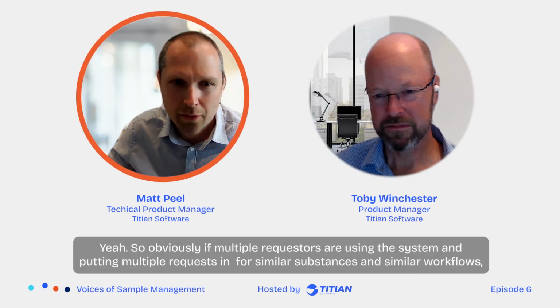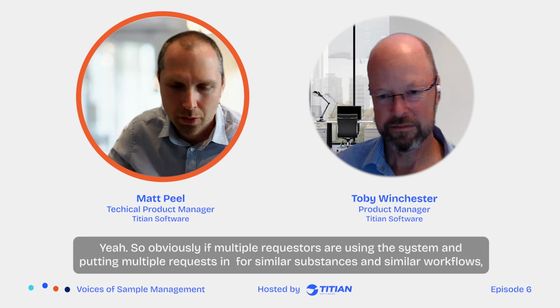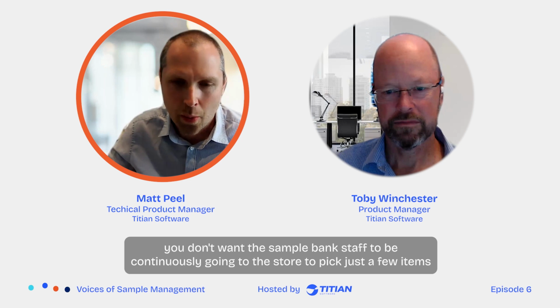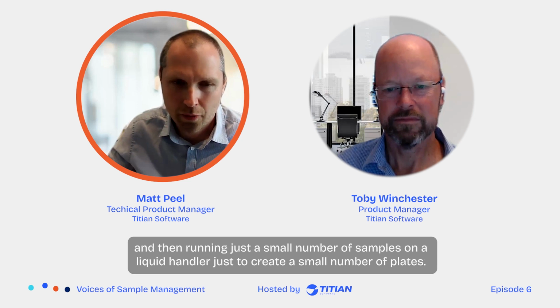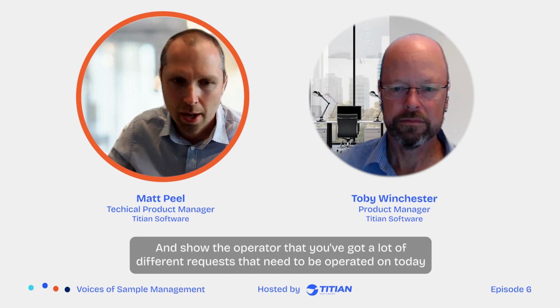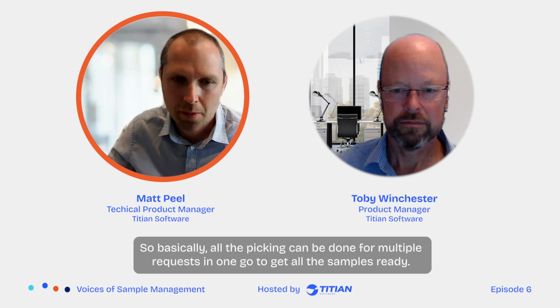Yeah. So obviously, if multiple requesters are using the system and putting multiple requests in for similar substances and similar workflows, you don't want the sample bank staff to be continuously going to the store to pick just a few items and then running just a small number of samples on a liquid handler just to create a small number of plates. You want the system to be able to bring all the similar work together and show the operator that you've got a lot of different requests that need to be operated on today. So basically all the picking can be done for multiple requests in one go to get all the samples ready.